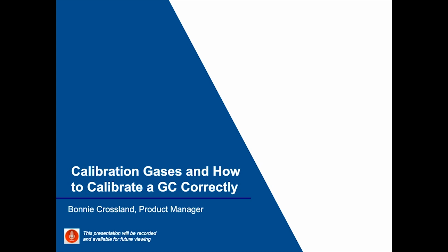This is Bonnie Crossland. I'm the product manager for gas chromatographs for Emerson. And today we're going to be doing a webinar on the calibration gases and how to calibrate a GC correctly. Most of this information will be applicable to anybody's GCs, preferably online GCs. There will be a few sections that relate to how you would do it with an Emerson GC, but I am pretty confident that it would be a similar process if you had a different GC than an Emerson one.